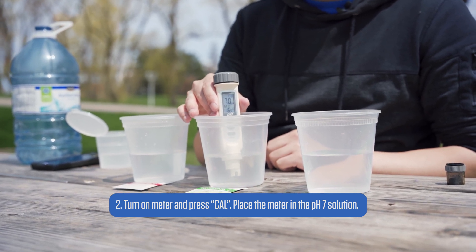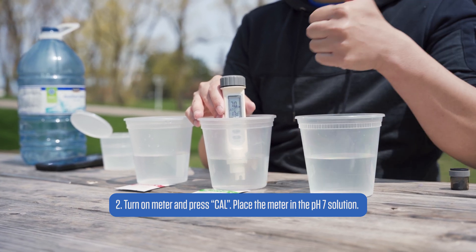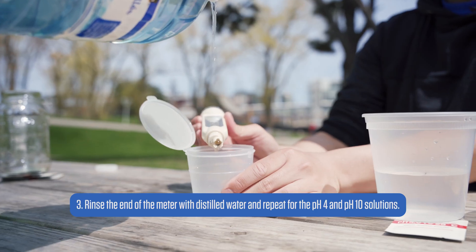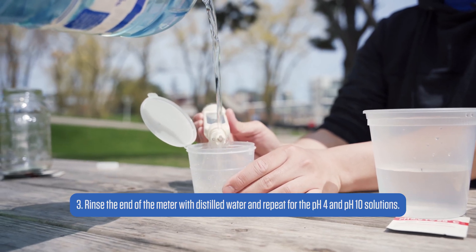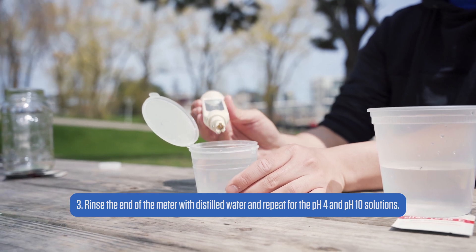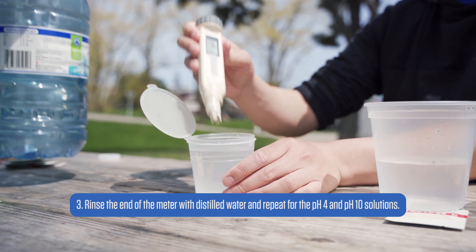Once the meter reads a stable value, without pressing a single key, the meter will automatically save the value and return to the measurement screen. You will have to repeat this process for pHs 4 and 10, but make sure to rinse the meter with distilled water thoroughly between different calibration solutions to prevent contamination and miscalibration.